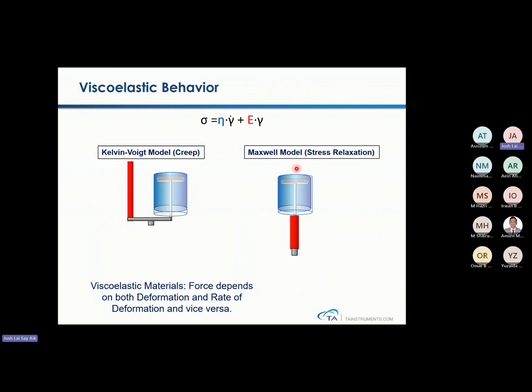Now, viscoelasticity. It means materials like polymers, or structured suspensions where you add particles inside your oil, and sometimes it behaves like a solid, sometimes like a liquid. It depends on what you expose them to. Let's say a fat sample: you put it at high temperature, it's going to start to melt and behave like a viscous material.